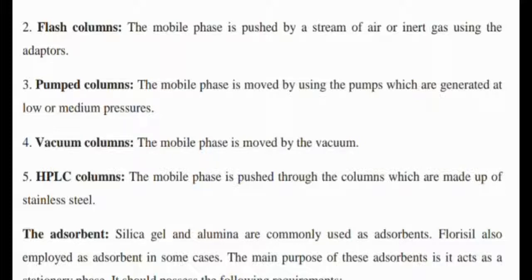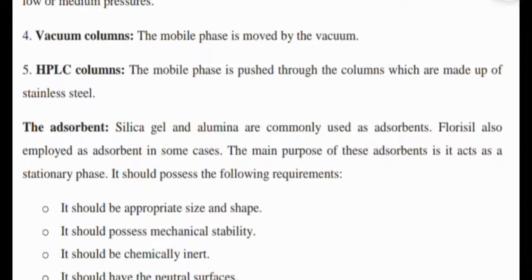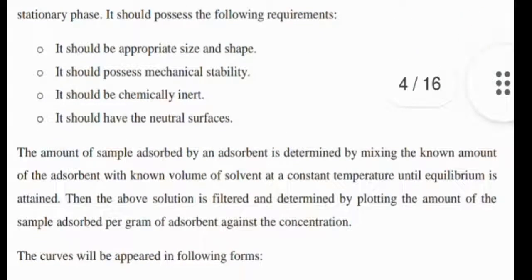Silica gel and alumina are mostly used as the adsorbents, and they have the following requirements. It should be of appropriate size and shape. It should possess mechanical stability. It should be chemically inert. It should have neutral surfaces.